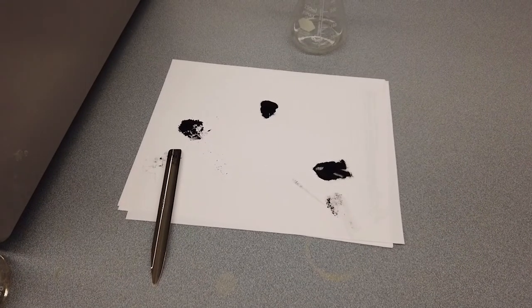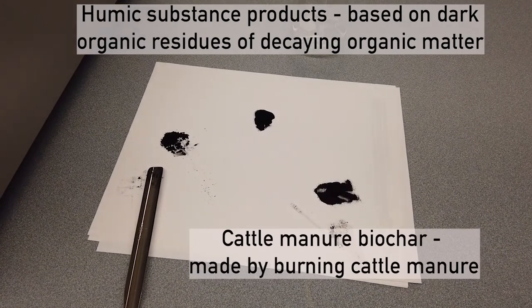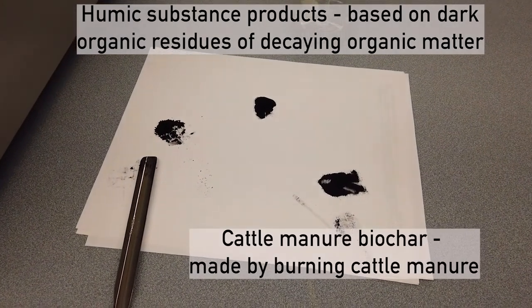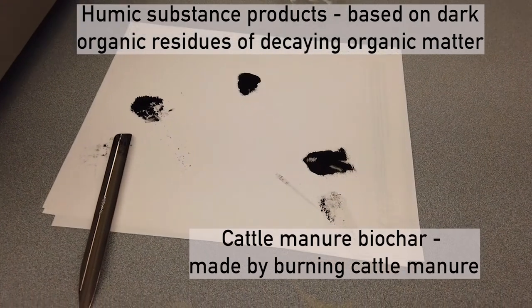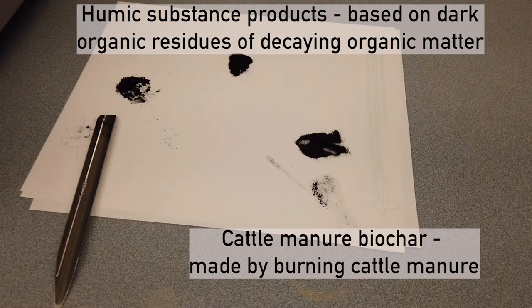The adsorbents I'm testing are two types of humic substance products and cattle manure biochar. Humic substances are dark organic residues of decaying organic matter. The two humic products are made from coal. Biochars are charcoal-like materials. Cattle manure biochar is made by burning cattle manure.